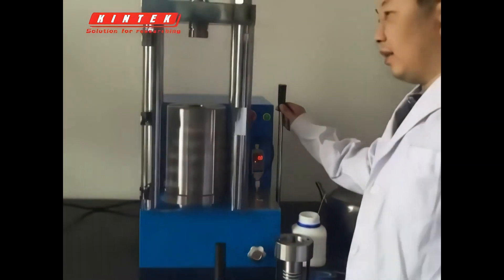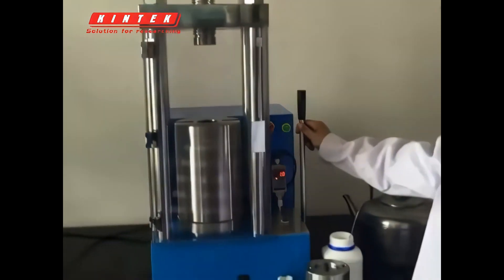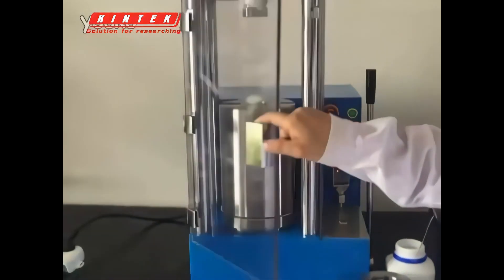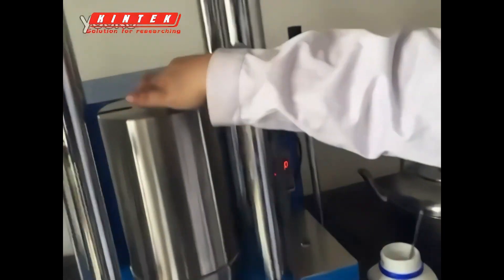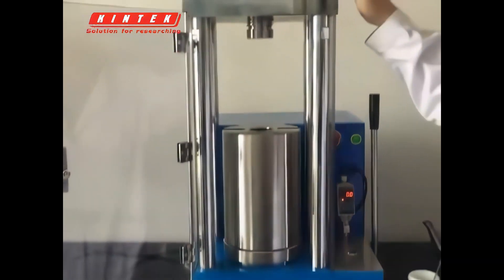This is an electric isostatic press. It has two modules: electric pressurization and manual pressurization. Here I will give you a demonstration of pressing samples. This cavity is 50 caliber, depth is 100, and its maximum pressure is 60 tons.